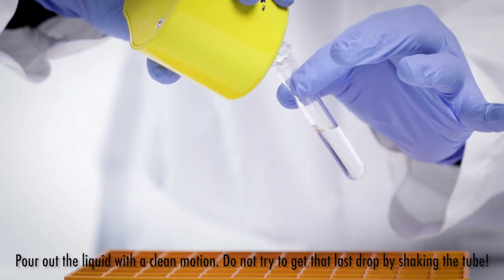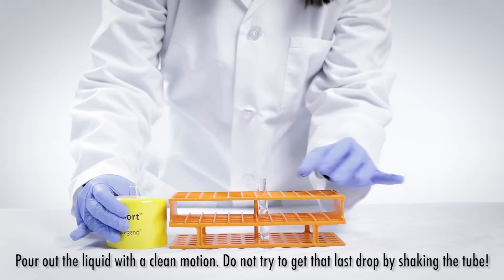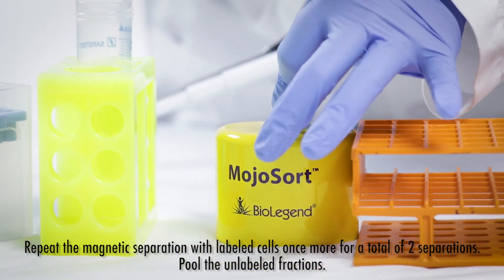Pour out the liquid with a clean motion. Do not shake the tube. Repeat magnetic separation with labeled cells once more for a total of 2 separations.